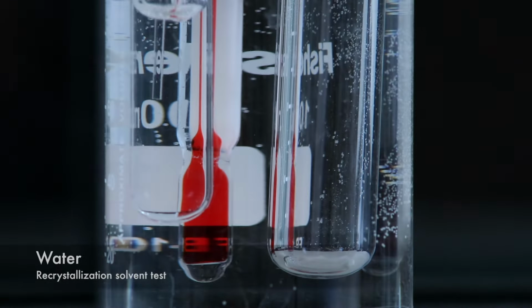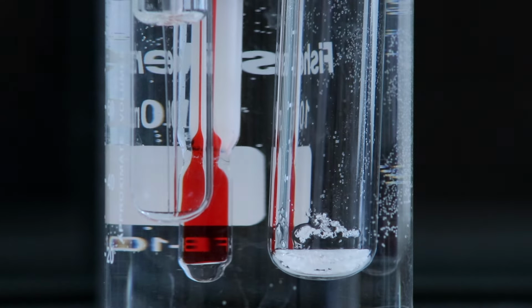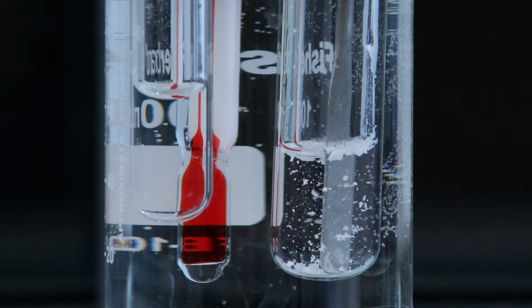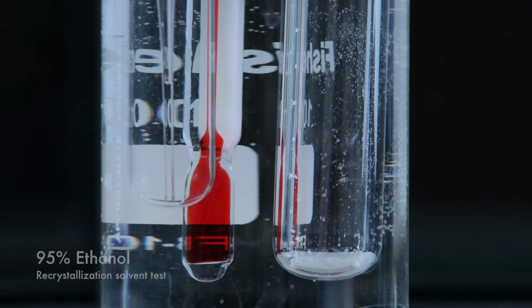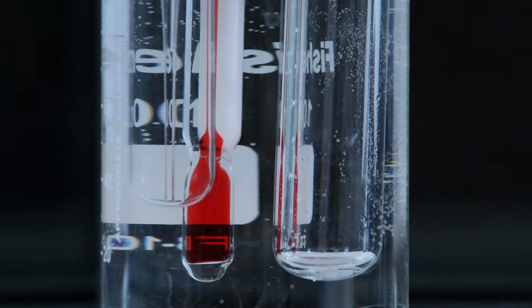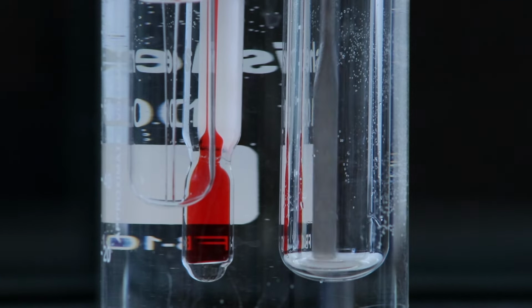The first solvent I'll test out will be water, so I'll add that with some stirring to try and dissolve the solid. But it was pretty obvious after a little bit that it's not dissolving in water even after I've added a bunch, so I'm going to try out a different one. Next, I'll test ethanol to see if that works better. And it looks like the solid dissolved in a really minimal amount, so I'm going to test to see if that even comes back in an ice bath.